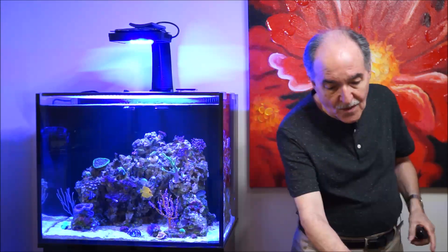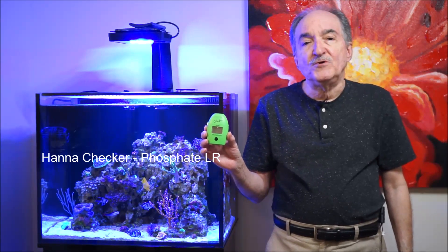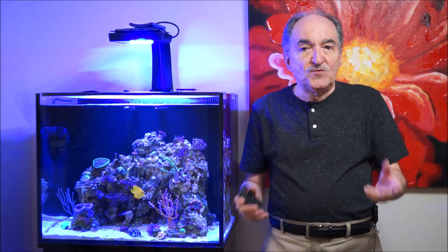Hi, I'm Eddie of Eddie's Reef O'Korea. Today's video is not on a fish or a coral. It's an informative video on the Hanna Checker low range phosphate test. I'm going to go into details, set up the camera on my dining room table, and show you how to actually do the test and little things you might not have known - like how to store the vial when you're finished.